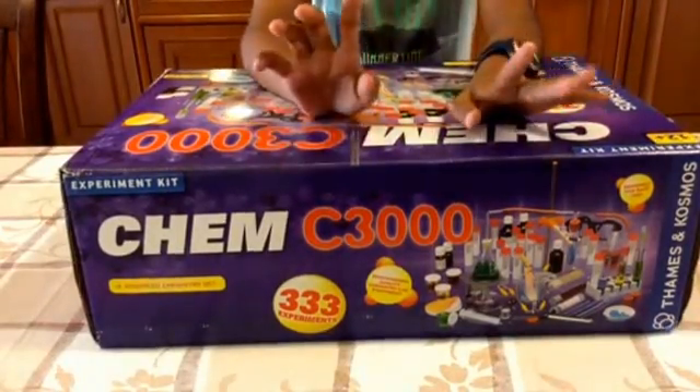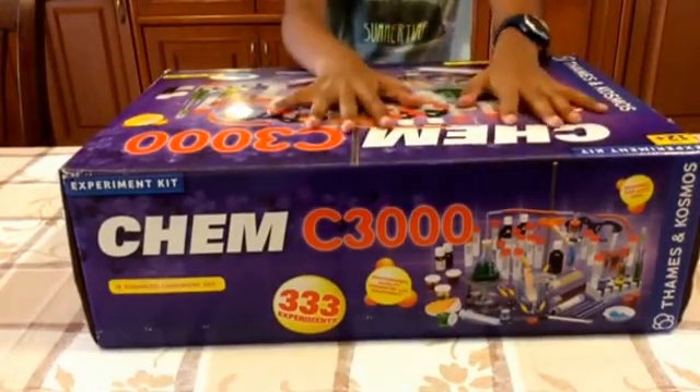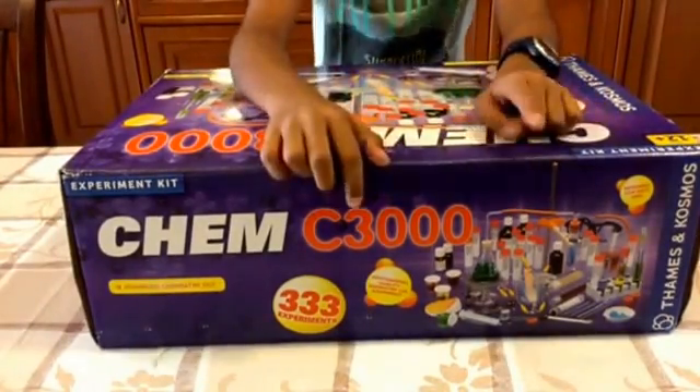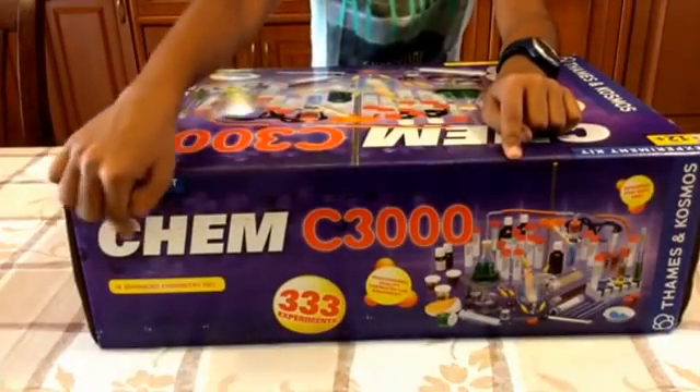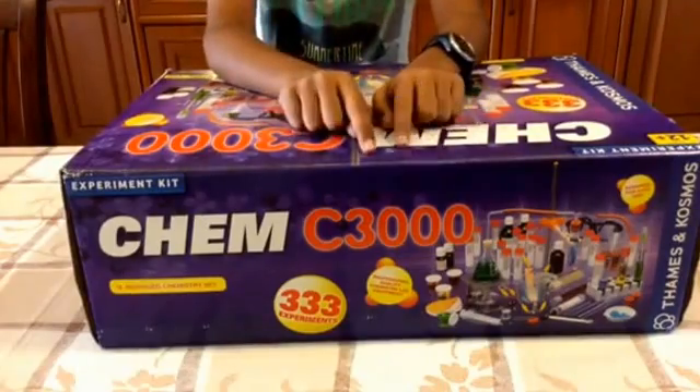Hi there, this is Cool Chemist once again, and in this video we are going to be unboxing the wonderful Chem C3000. This is one of the best chemistry kits on the market.